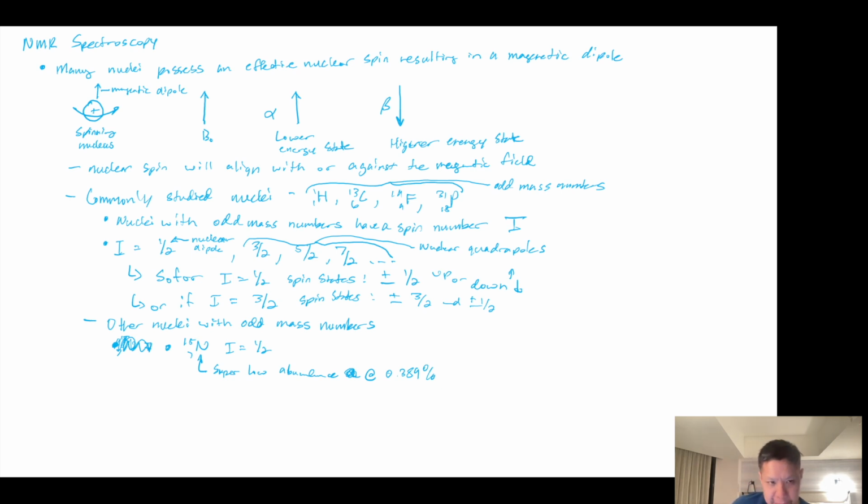So you might be asking yourself, why do we even study it then if its abundance is so low and it's not helpful? Well, actually, that is very helpful, because it's most commonly used in my favorite NMR technique, which is protein NMR. Not proton NMR, but protein NMR.